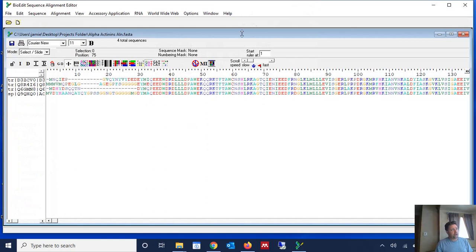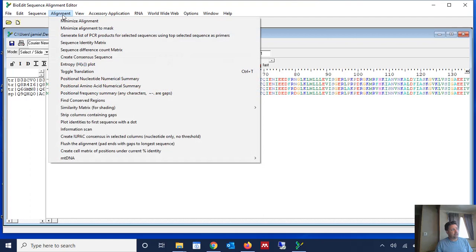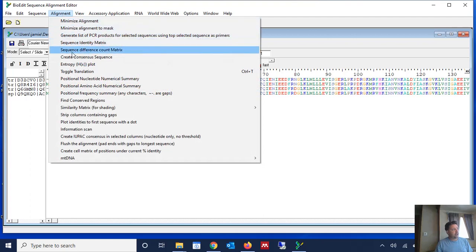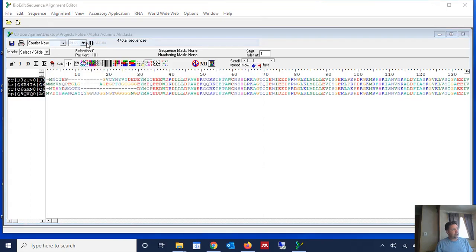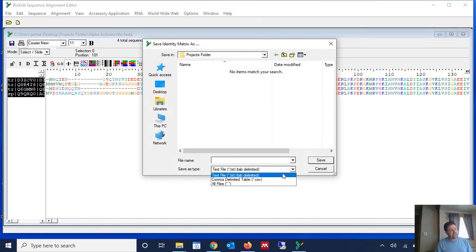And now that I have it open in BioEdit, I'm going to go to alignment and I'm going to go to sequence identity matrix and I'm going to choose where to save it and I'm going to save it as a CSV file.